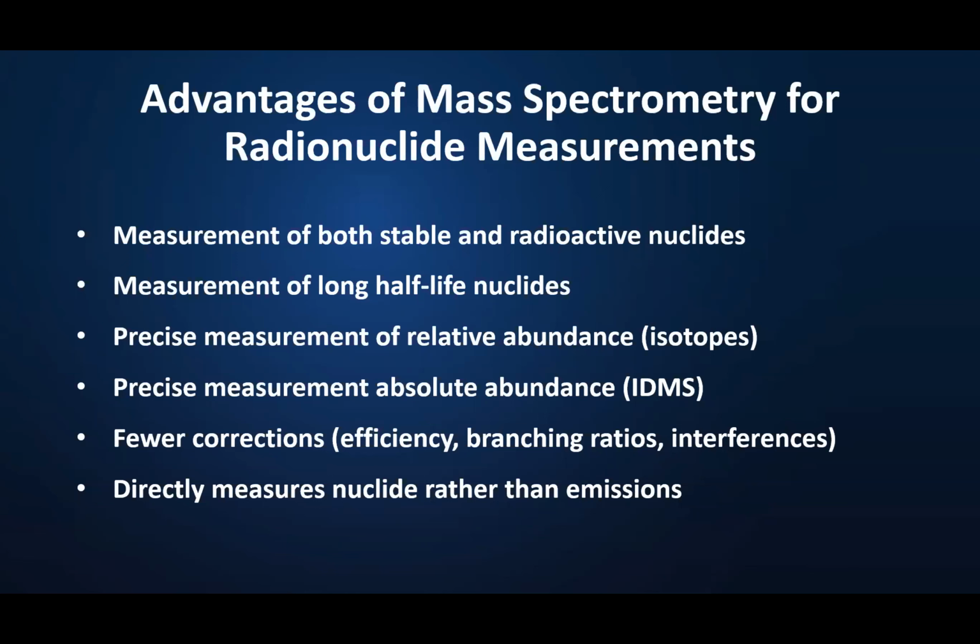Richard, I just have, coming in as a chemist and mass spectrometrist, can you speak a little bit about the practical or useful uncertainty regime where CCRI usually operates? So what are the uncertainties that the CCRI community or stakeholders are looking for? In chemistry, we usually work in the low percent for isotope ratios, in the low per mil or sub per mil range. So where do these radiometric measurements operate? Are there potential synergies?